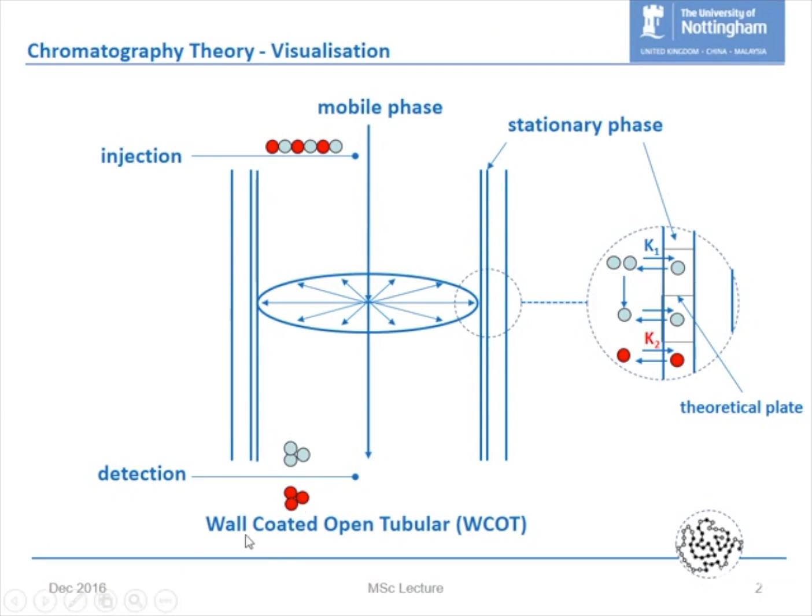Now, detection is an absolutely fundamental thing. There's a whole series of detectors that are possible to you, and you've seen some of them this morning when Steve showed you through the SEC system that we've got. We'll talk a little bit more about detection later. But that's basically the fundamental process that goes on in chromatography. So now what we want to do is take those concepts and move them into what we're talking about this morning, which is gel permeation chromatography or gel filtration.